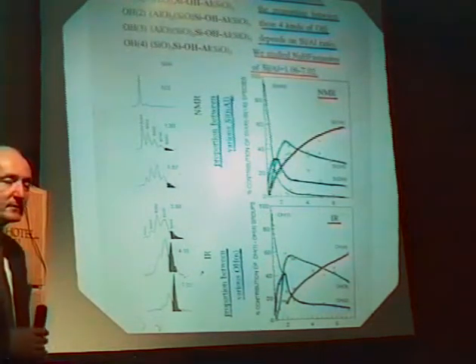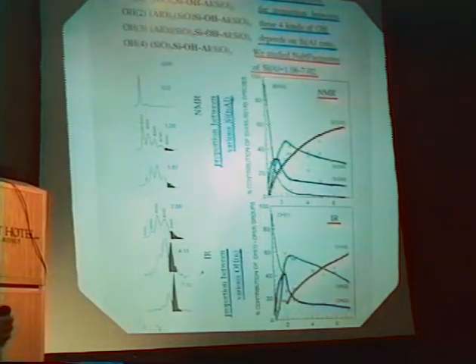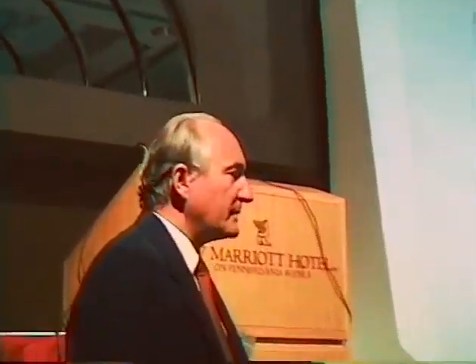But this agreement means also something else. Hydroxyl groups are active sites in many reactions important for catalysis. And the information on the hydroxyl groups of zeolites, on the acid sites on zeolites, may be obtained not only by direct studies of OH groups, for example by IR spectroscopy, but also by indirect studies of the properties of silicon atoms by NMR.